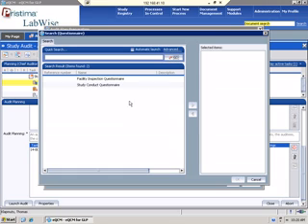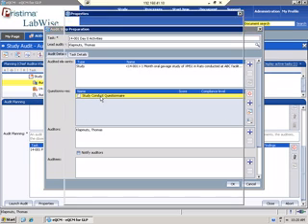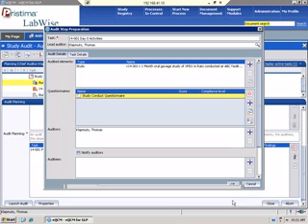And so when I click on the plus button, I have 2 questionnaires. I have a facility inspection questionnaire created and a study conduct questionnaire. So we're going to pick the study conduct. And so now we add that. I can just open it up and look at it, there's 4 questions. These are the details. If I wanted to add a question to it, I could.